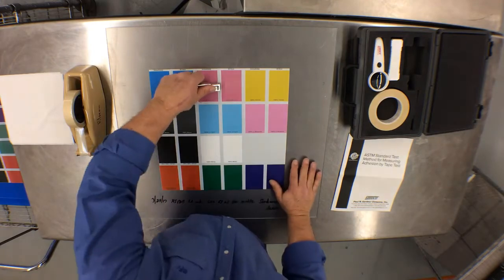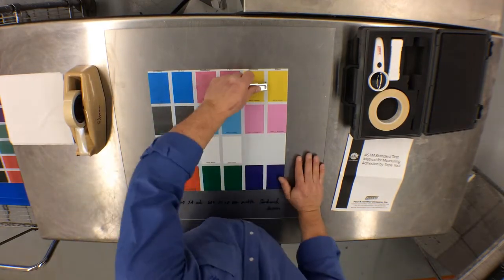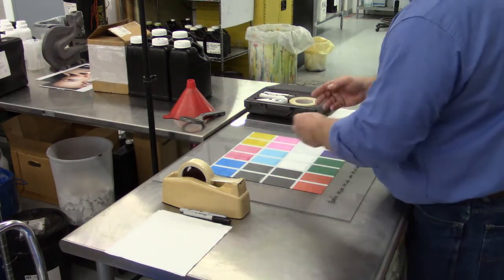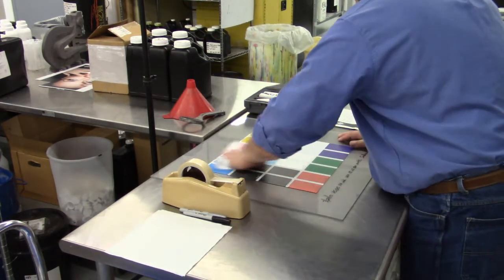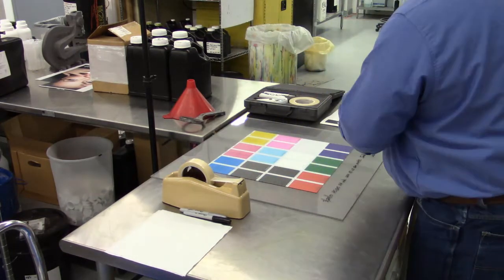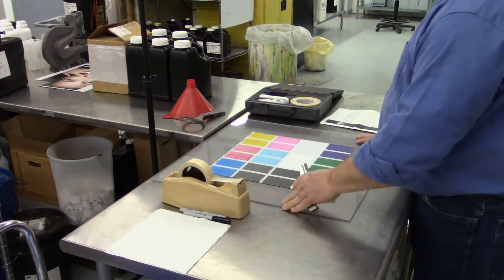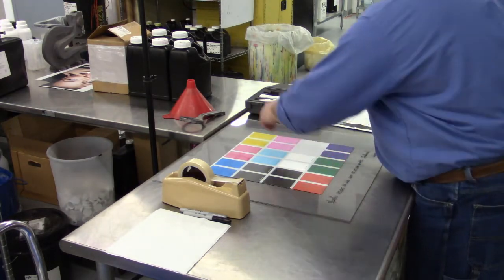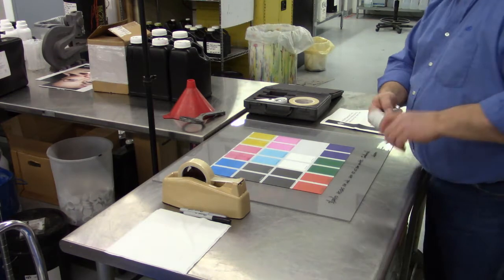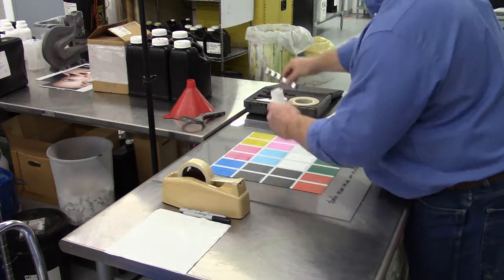We will be repeating this activity for the other color blocks on the printed sample. Once we have our bi-directional cuts complete and we've completed our three crosshatch cuts, it is recommended to clean the surface of the material with a dry lint-free wipe. In order to keep the blades clean from any debris picked up during the crosshatch cutting process, it is recommended to clean the blades using the brush that came in the carrying case.